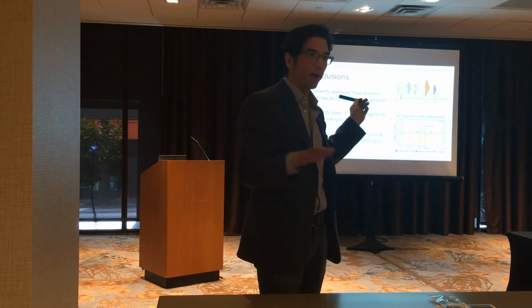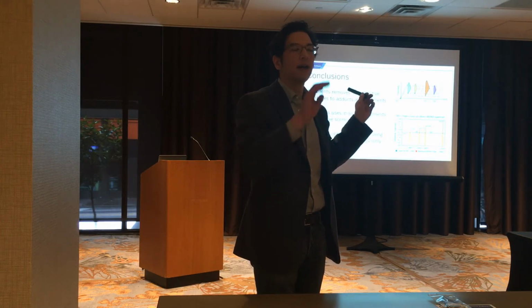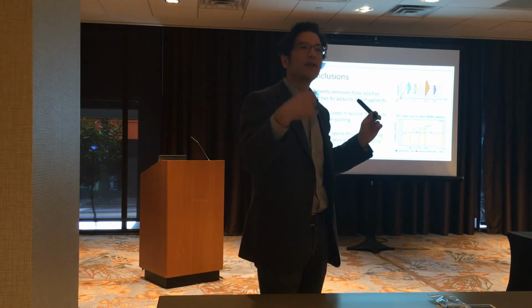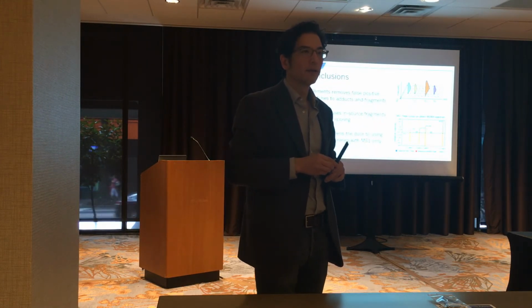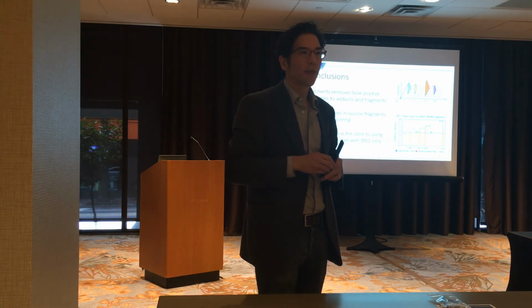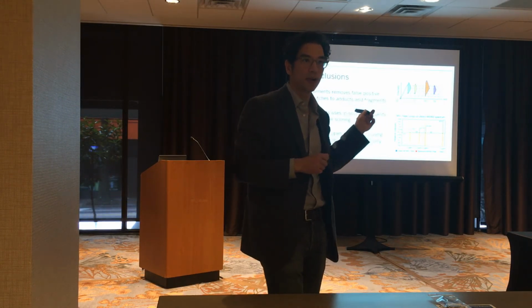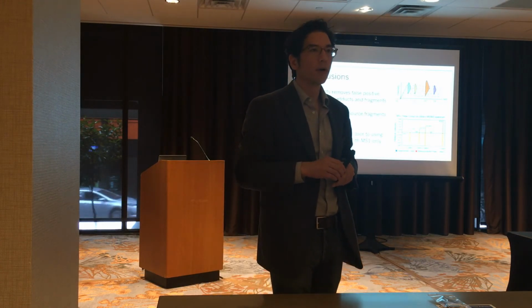Here, this is done without any in-source fragment boosting, because there's a setting that you can do to increase the energy in the source. So this is done without any of those crutches, but potentially you could use that to do even better, or be able to see these even more.